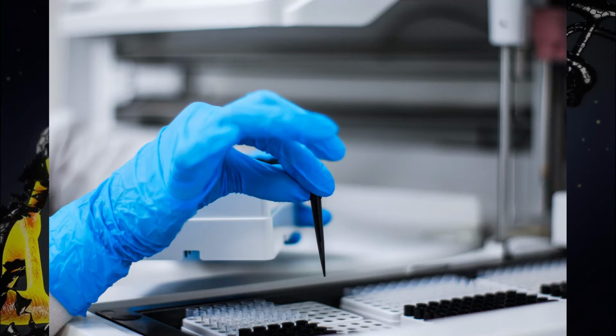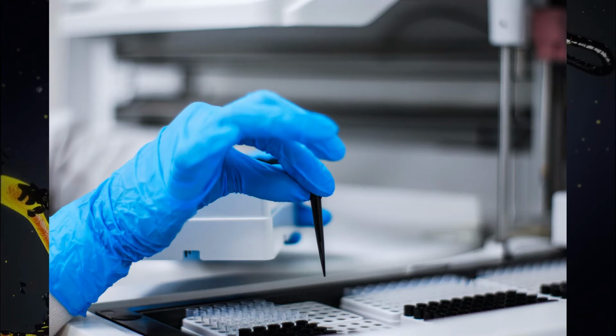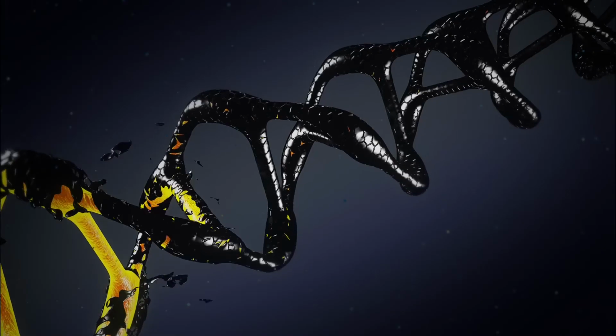If you need to be even more exacting than what occurs in nested PCR, you should be looking at high fidelity PCR. This is essentially a process that is a lot more exacting and requiring of knowledge than the others have been. It's often used for cloning and similar applications. You don't want to make mistakes in transferring or copying DNA sequences if you're trying to make a clone. The entire point of the clone is that they should be exactly the same.